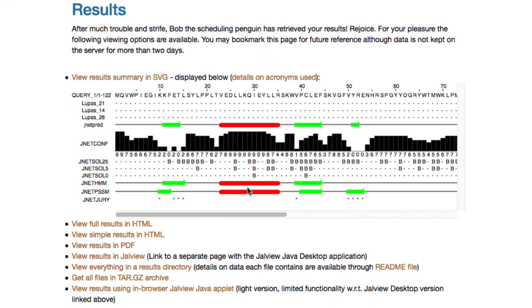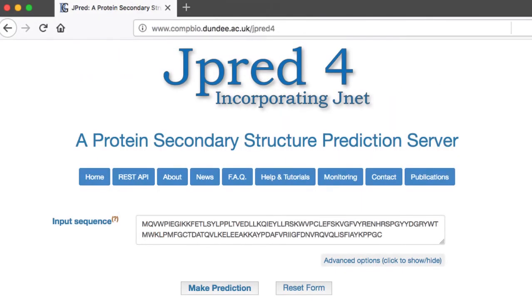The webpage updates to reflect the progress of the prediction. To learn more about JPRED results and the various files produced, please view our previous video. For more information about JPRED 4, please visit the JPRED website.